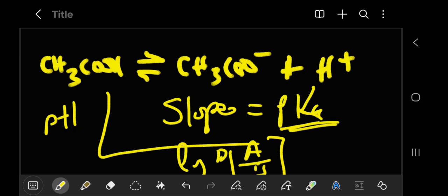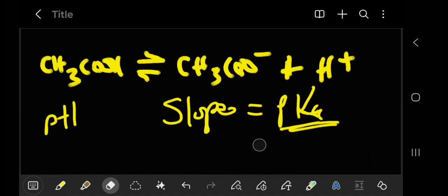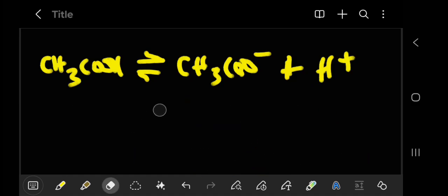And we know what pKa is. pKa is the negative log to base 10 of the Ka, which is the dissociation constant. So it's the negative log. That's literally what it means. It gives you an insight on the ionization constant, which is the Ka, because as Ka increases, pKa decreases. Do you understand? So whatever value you get, you're supposed to compare with standards to be sure that that value is that of acetic acid.